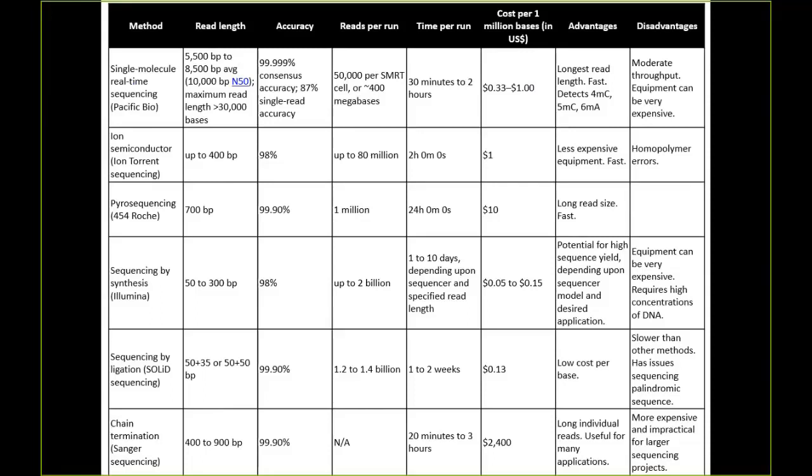So if you have a chunk of chromosome that's been inverted, so it's actually been cut out and flipped around, PacBio is probably the best thing to pick that up on. Or if you have a big chunk of chromosome that's been deleted, PacBio is great for that. If you have a big chunk that's been inserted, PacBio is great for trying to read through that whole thing. But if you're just looking for that one A to T change that's causing some weird skeletal disease in your patient, PacBio is probably a really bad choice.